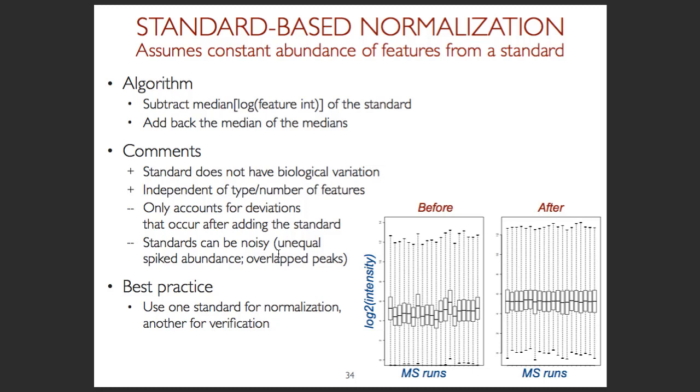It is also good to have standards which control for different things, a standard for digestion and then a standard for data acquisition and so on. But it's always good to have one standard which was not touched so that we can see how normalization affected that standard, where we know that there is not supposed to be any change due to the biology.